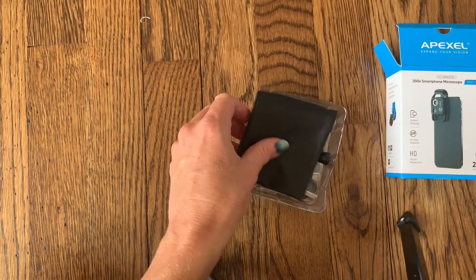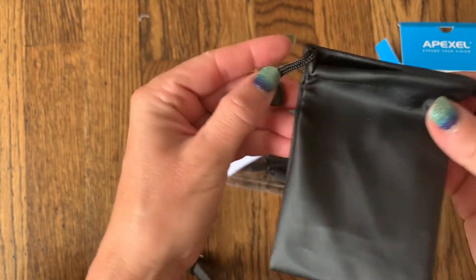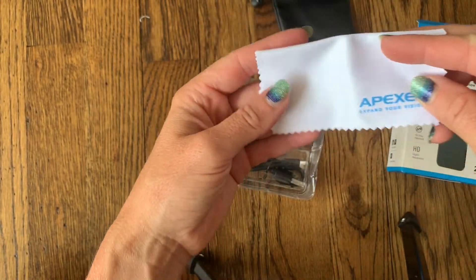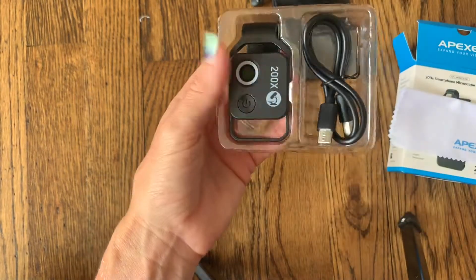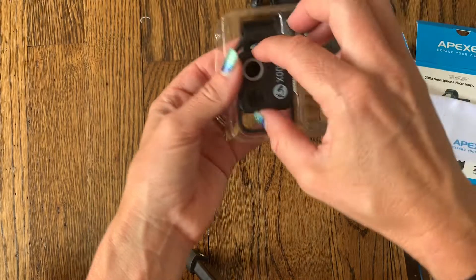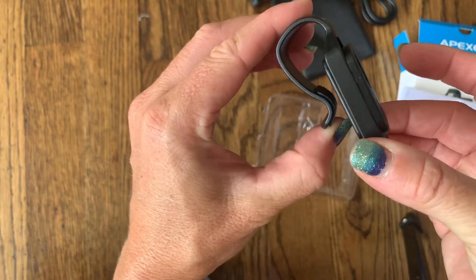The next thing inside the package is a little bag you can use to store the microscope and keep it protected and scratch free. It also comes with a cleaning cloth so you can keep it nice and clean and working well. And here is the microscope itself — you can see how small it is. It comes with a charging cord, so you just need a block to plug it in and charge it to keep it working all the time.